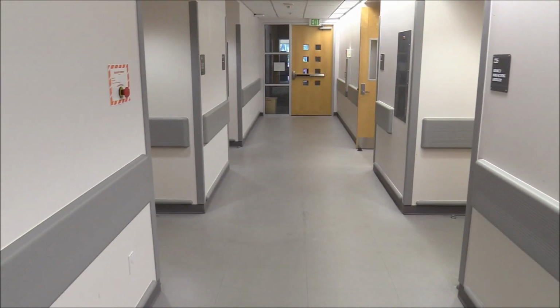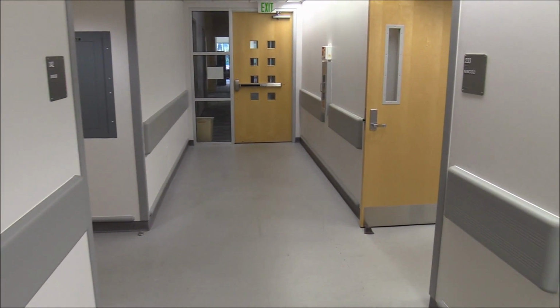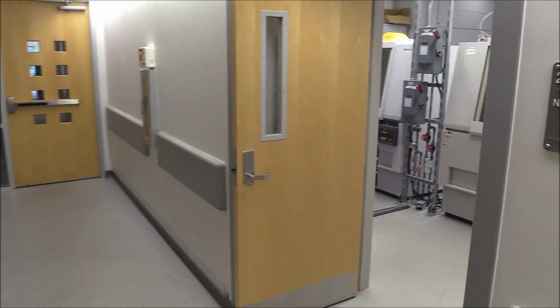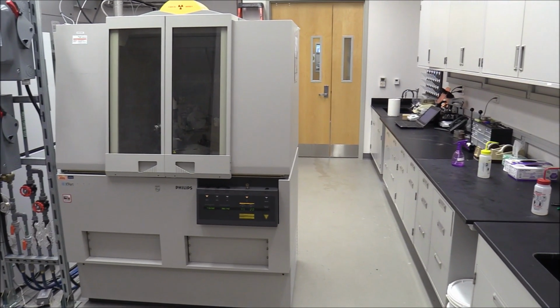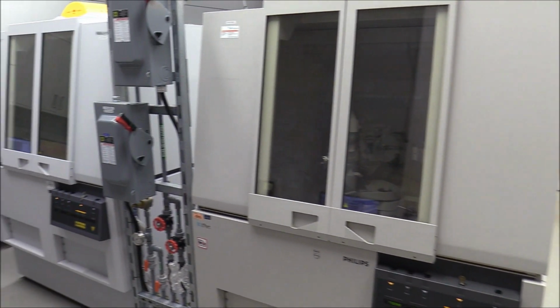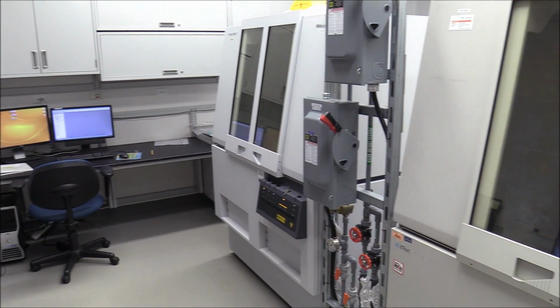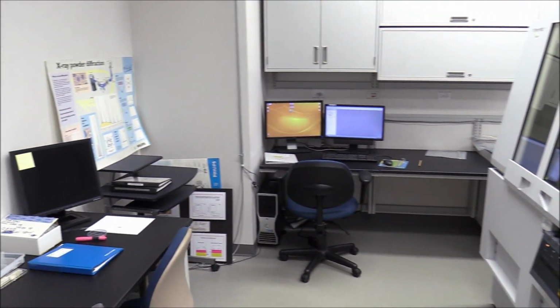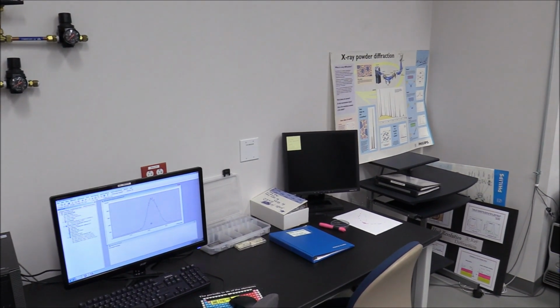The last room on our tour houses the X-ray diffraction lab. It's got two X-ray systems. There's a material research diffraction system for specific analysis such as rocking curve analysis and reciprocal space mapping, and a powder X-ray diffraction system which is used for phase identification and quantification analysis. The lab also provides specialized software for data reduction and analysis.